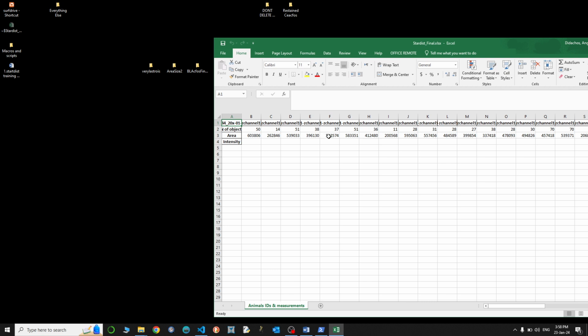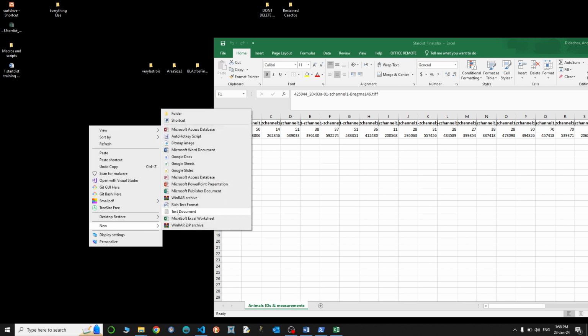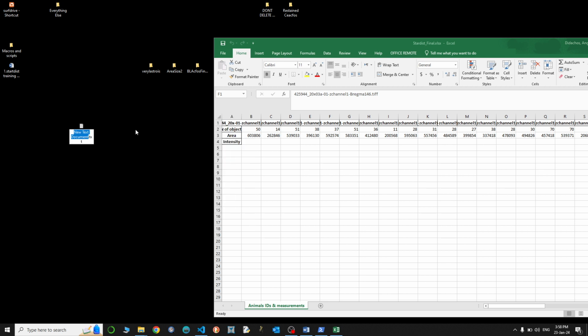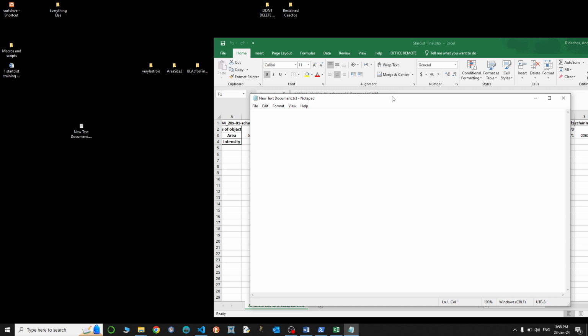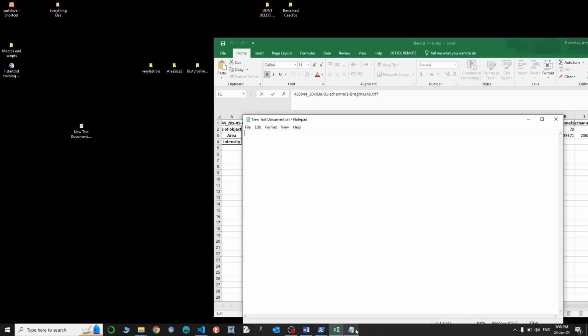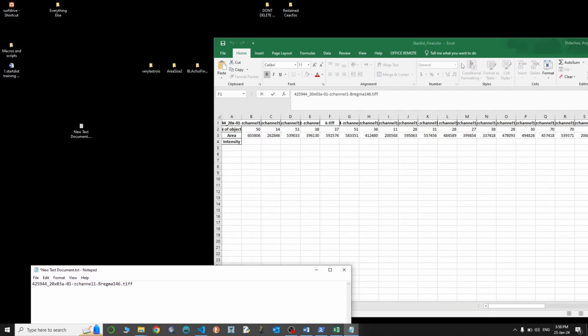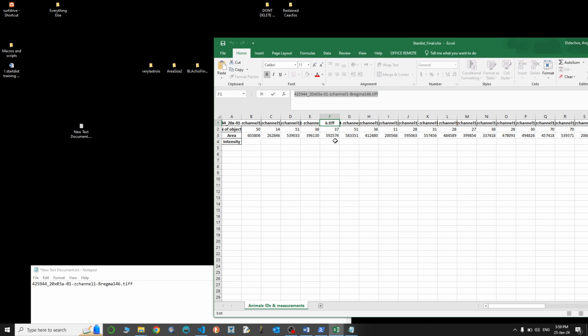Well, first of all, let's pick just one file, okay? And I will just keep the name of it because I can forget quite easily. So that's our file. And now we want to see if indeed for this file we have 37 neurons and if the area corresponds roughly to this one.